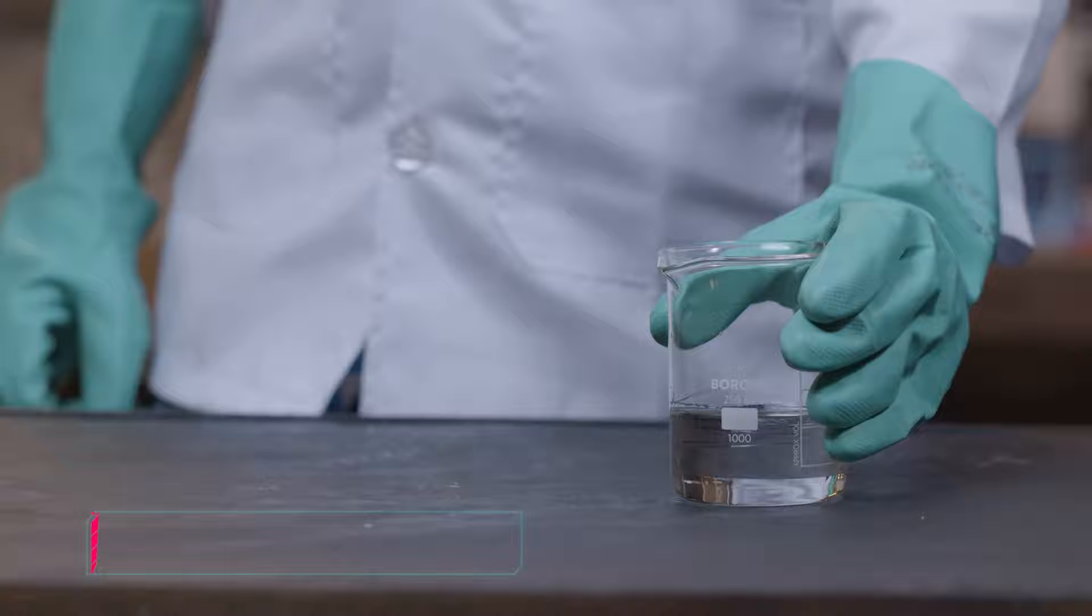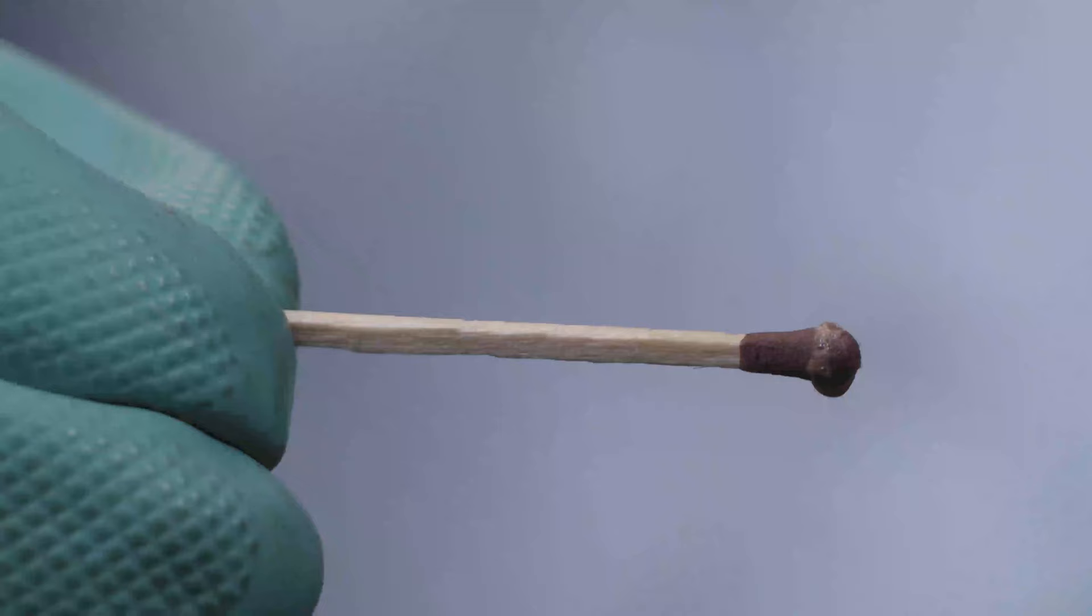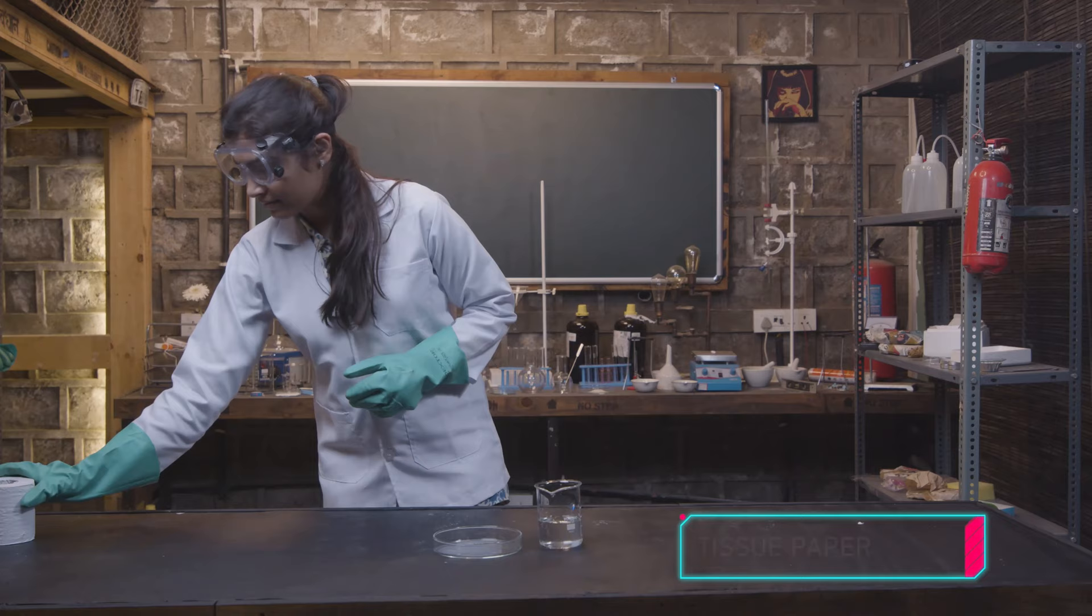Next up, matchsticks. Pour sulfuric acid in a beaker and dip the head of a matchstick into the acid. And we mean only the head. Hang on to the wooden part carefully. Now watch how within just a few seconds it automatically bursts into flames. Pretty sight, huh?